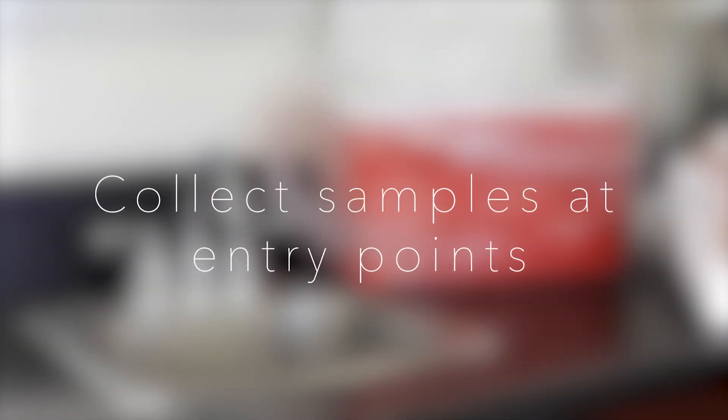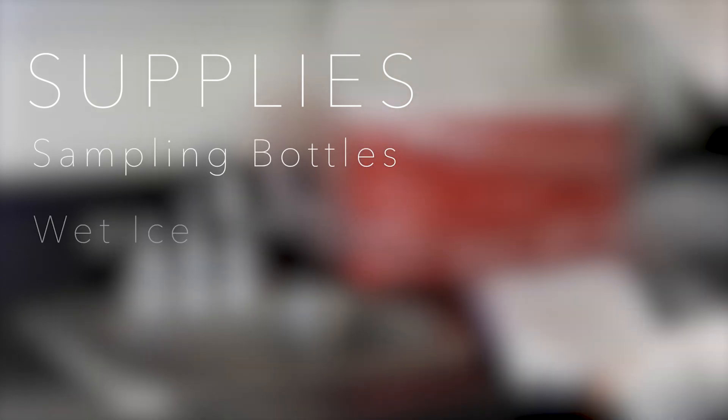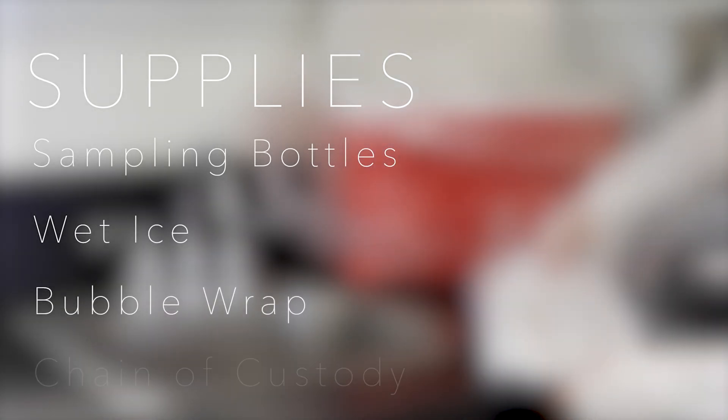Samples should be collected at entry points to the distribution system. Make sure you have all the supplies to complete the sampling process, including sampling bottles, ice, bubble wrap, and your chain of custody form.